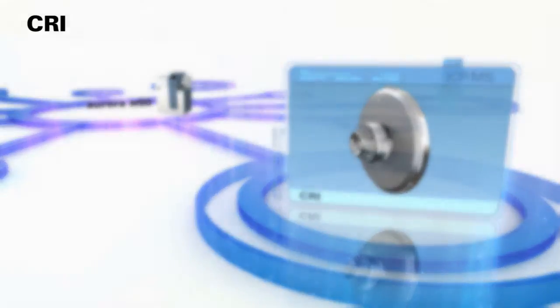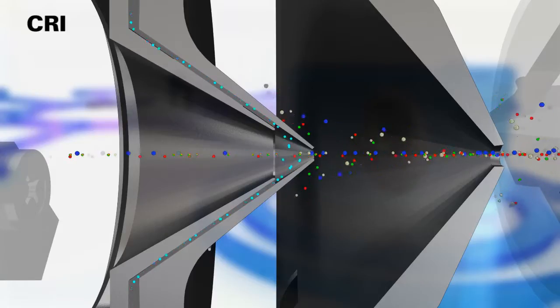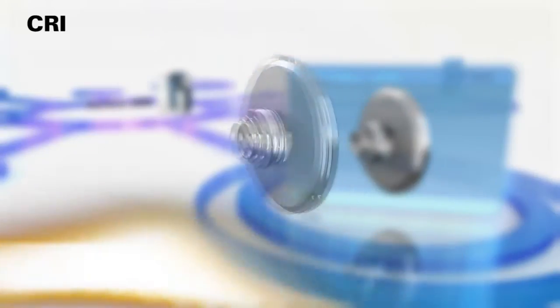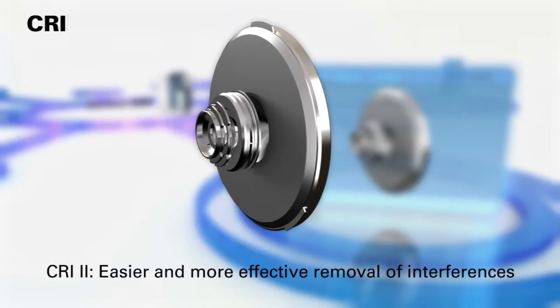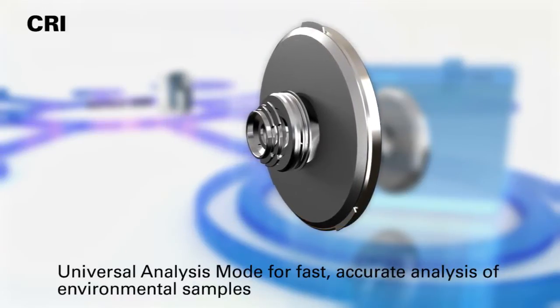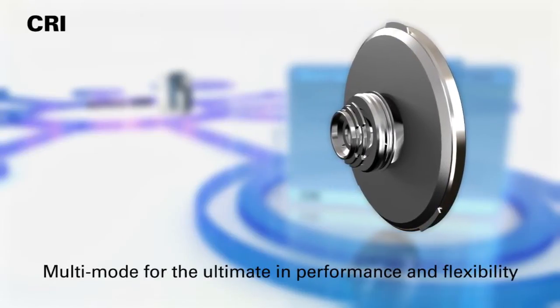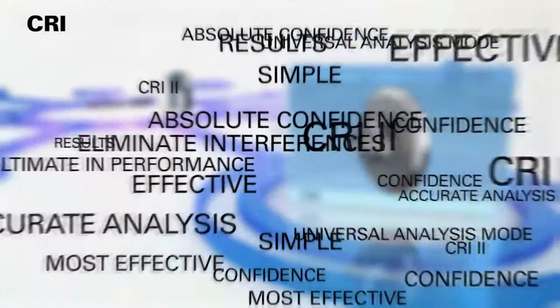CRI. The Aurora M90's new and improved collision-reaction interface, CRI2, provides even simpler and more effective removal of spectroscopic interferences formed by plasma gases and sample matrix components. CRI2 offers easier and more effective removal of interferences, with a universal analysis mode for fast, accurate analysis of environmental samples, and multi-mode operation for the ultimate in performance and flexibility. If you need absolute confidence in your results, CRI2 is simply the easiest and most effective way to eliminate interferences.